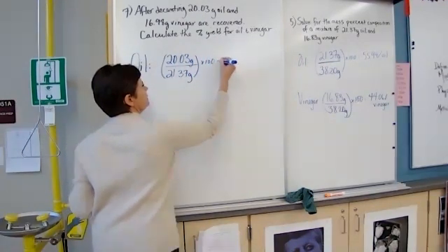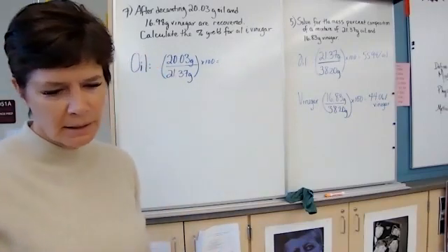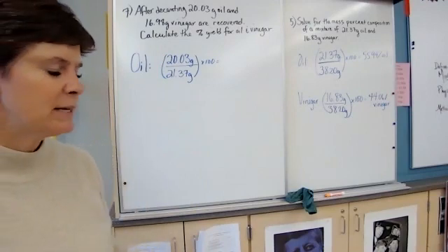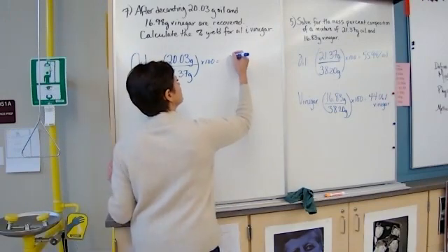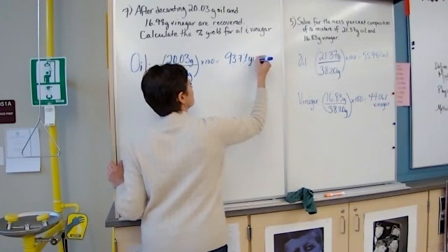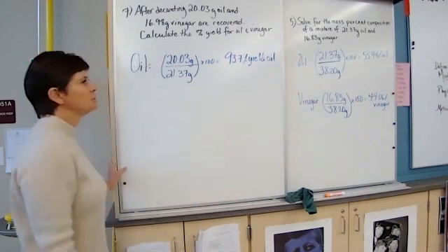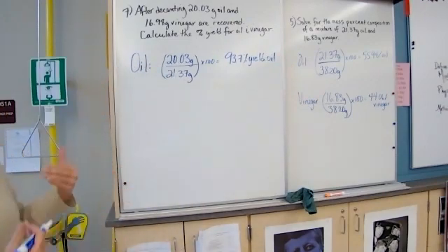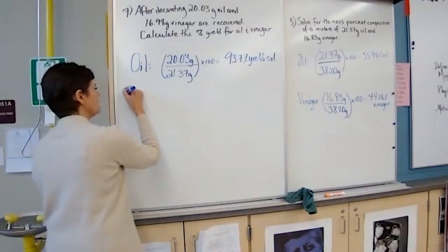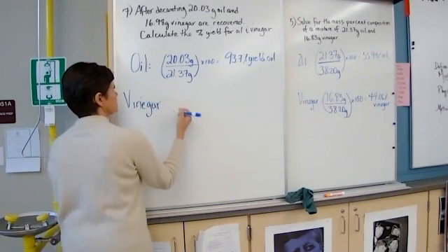So we run the math on that, and we can see that we are less than 100% for our yield here. And our calculation shows that we have 93.7% yield for oil. Okay. So we didn't get back all of the oil that we put into the mixture, but that's okay, because sometimes with separations, we're definitely not going to have perfect separations occurring.